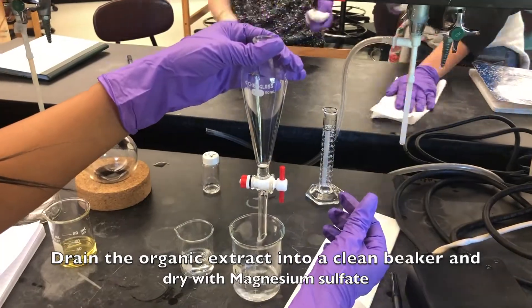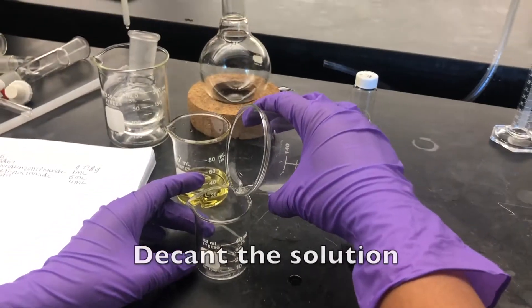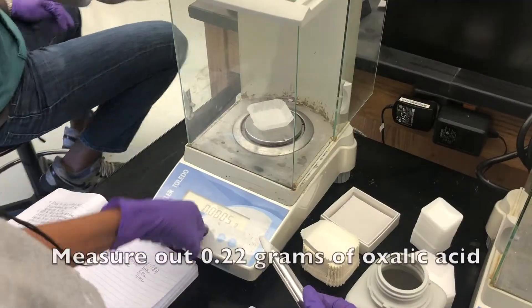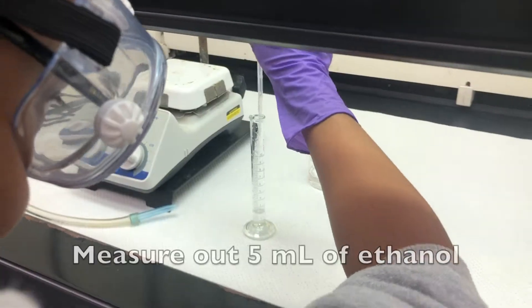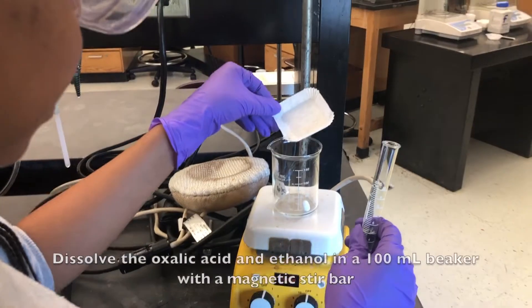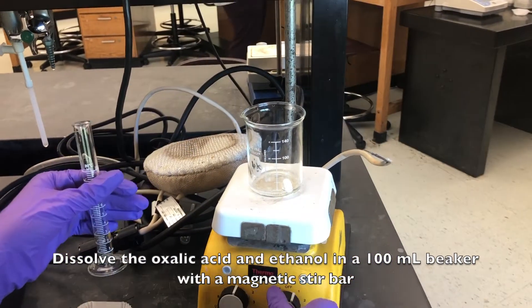Drain the organic extract into a clean beaker and dry with magnesium sulfate. Decant the solution. Measure out 0.22 grams of oxalic acid. Measure out 5 milliliters of ethanol. Dissolve the acid and the ethanol in a 100 milliliter beaker with a magnetic stir bar.